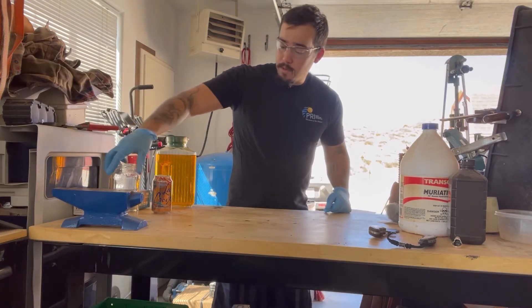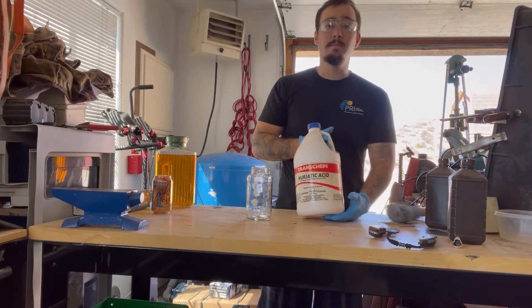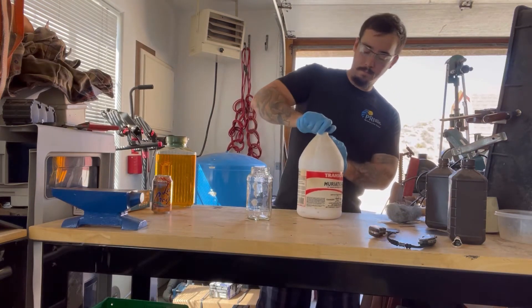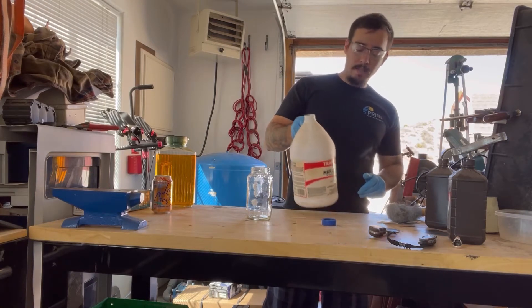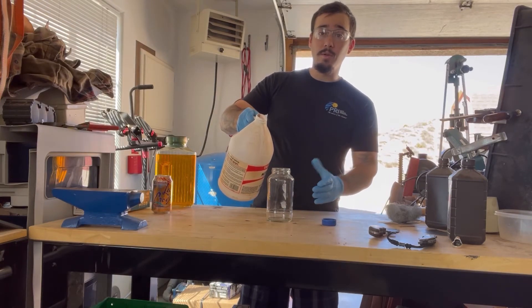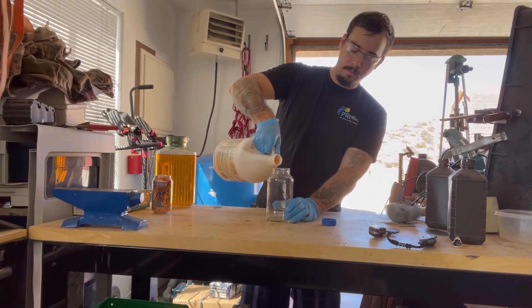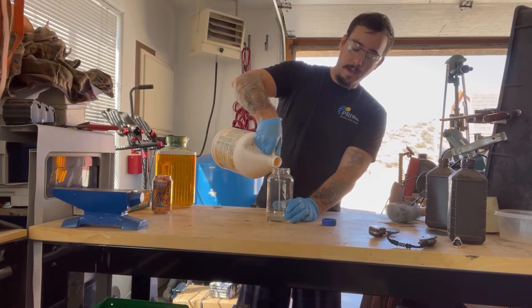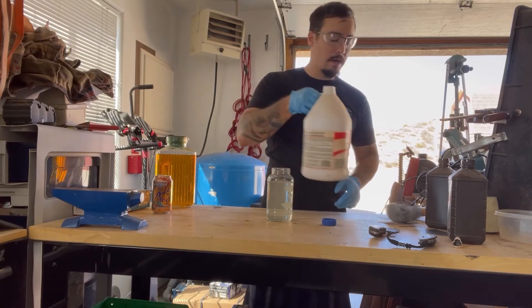What we're going to start with today is muriatic acid. Muriatic acid is usually used to balance the pH in pools, and you can pick up a gallon of this for about seven bucks. This container that I have is 24 ounces, so we're going to add 24 ounces of muriatic acid.